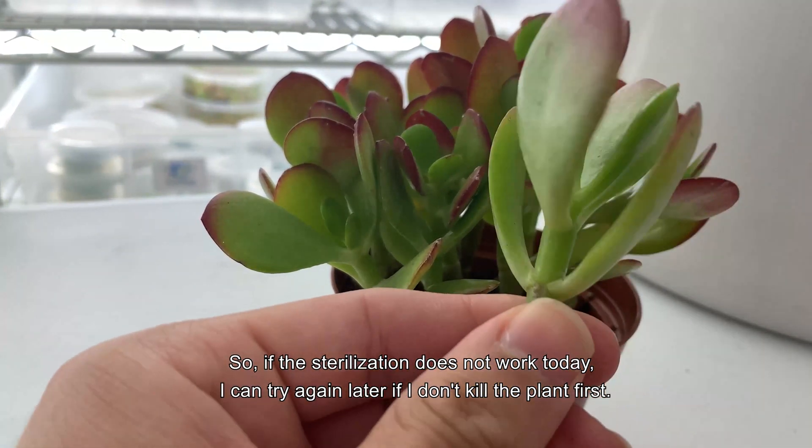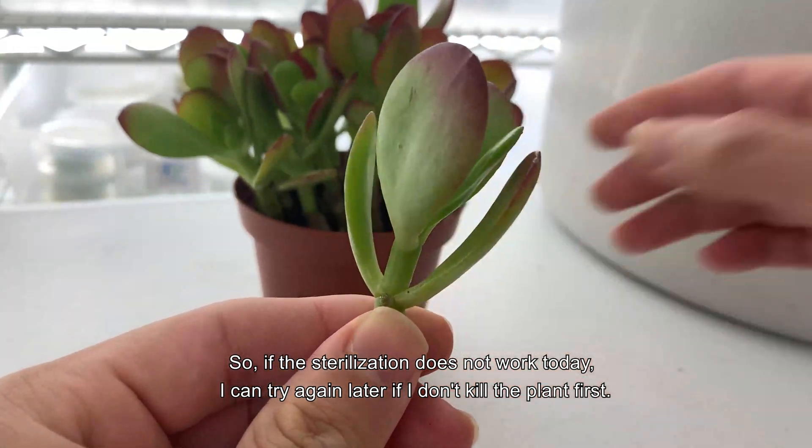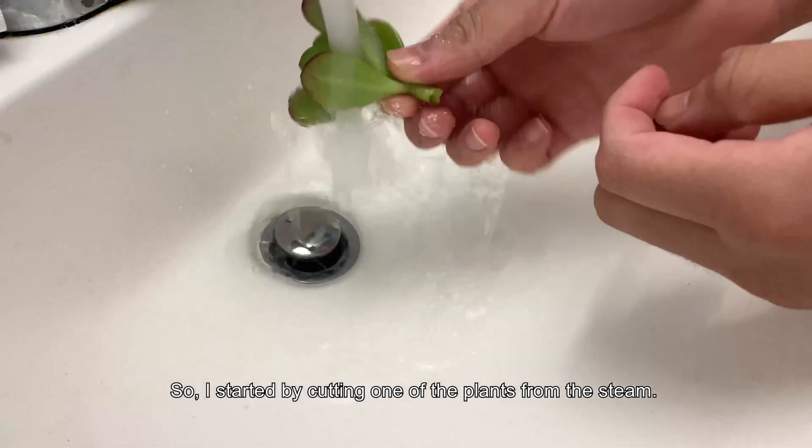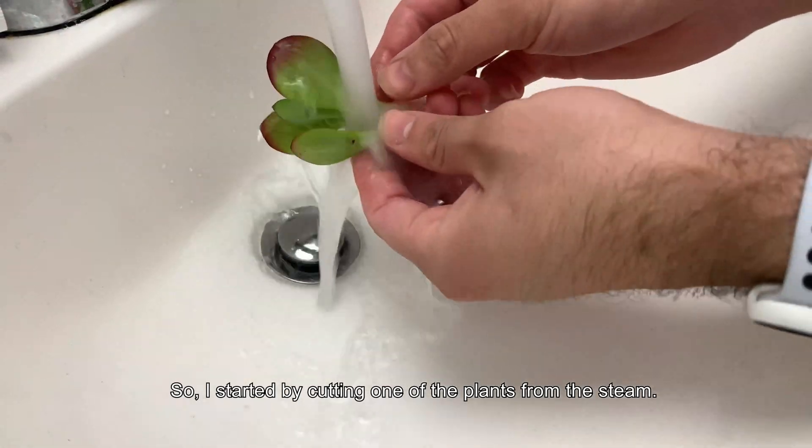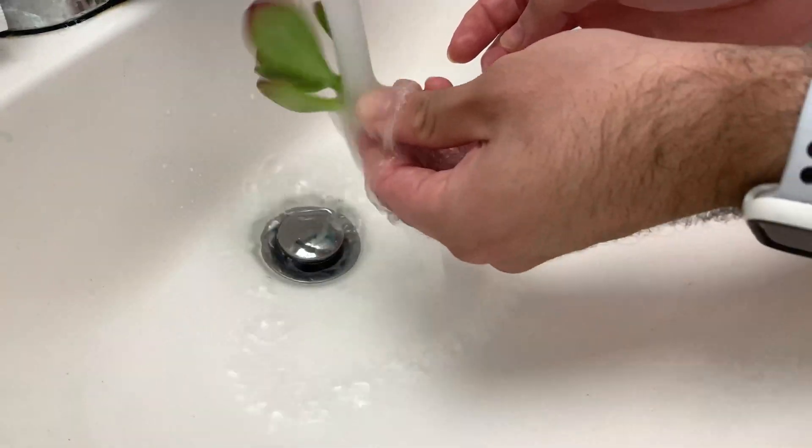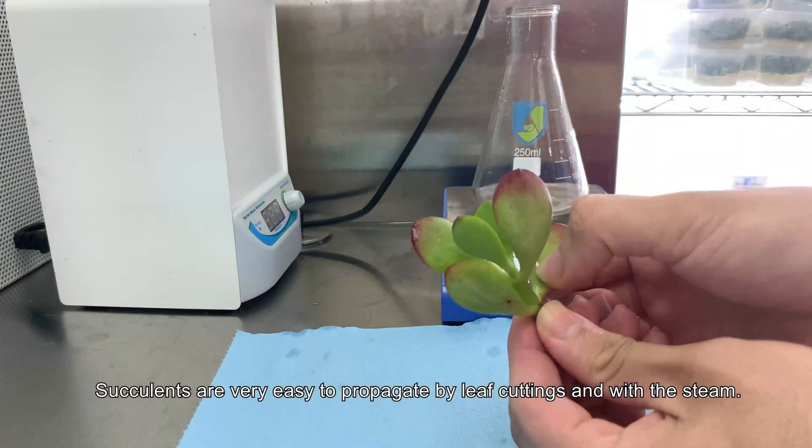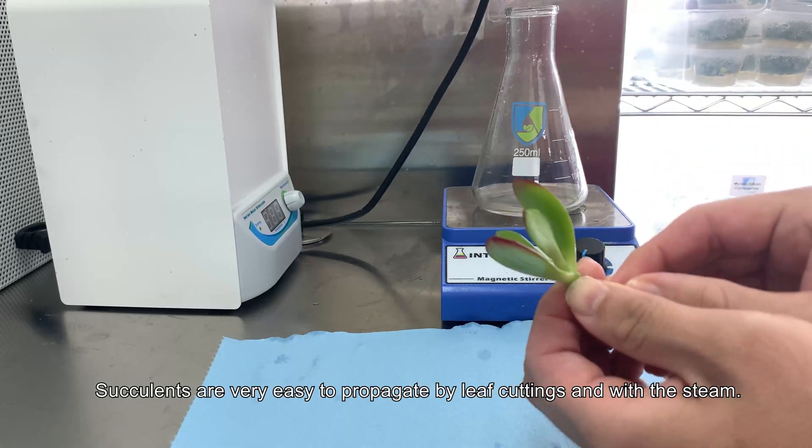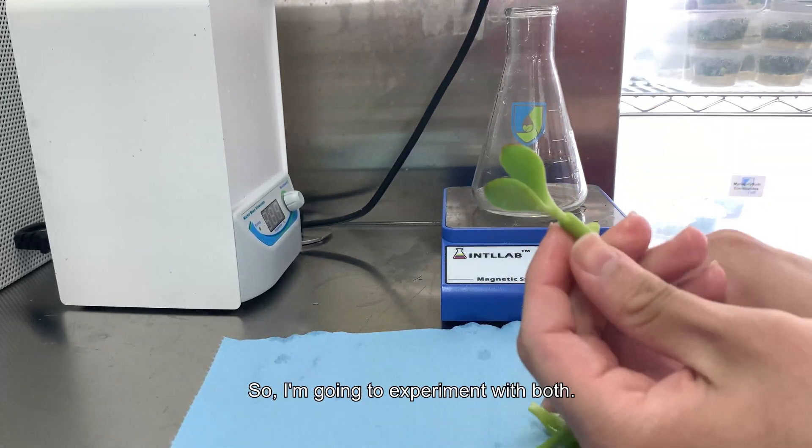If I don't kill the plant first. So I started by cutting one of the plants from the stem, take the explant to the sink, and clean all the dirt from the plant. Succulents are very easy to propagate by leaf cuttings and with the stem, so I'm going to experiment with both.